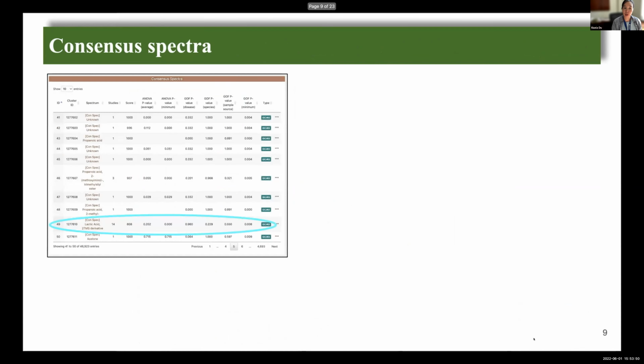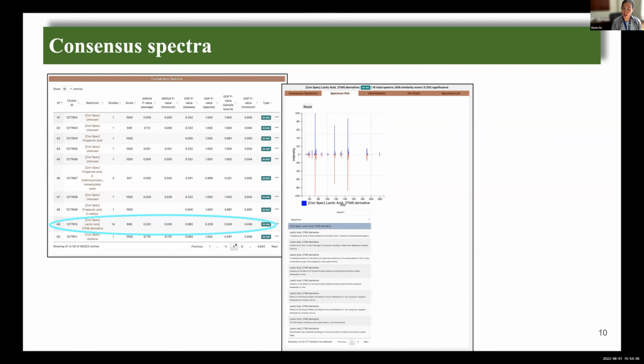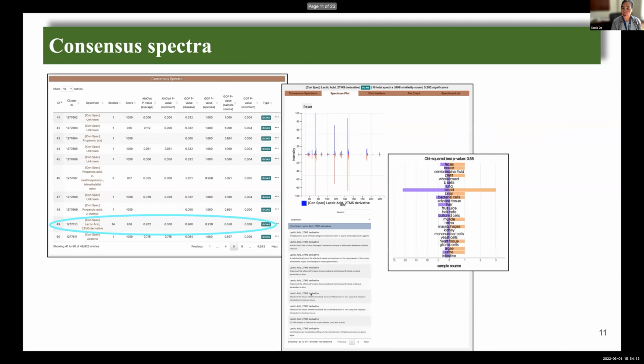If we go into a little more detail to look at the consensus spectra that we have constructed, for example, here is a particular consensus spectrum among close to 47,000 of them. If we click, we can see all the original spectra that we have extracted from various studies. We can also see in this particular cluster the distribution of sample sources and other tag values, like diseases and instruments, as I showed earlier.